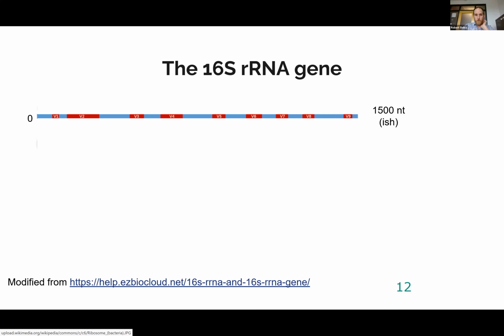And it turns out that for various reasons, the 16S ribosomal RNA gene is a good choice. Part of these are historical. I won't get into it, but it's got a good length and it's got certain useful patterns of variation that make it a good target for fairly small scale taxonomy, and then taxonomy that spans the entirety of microbial biodiversity.